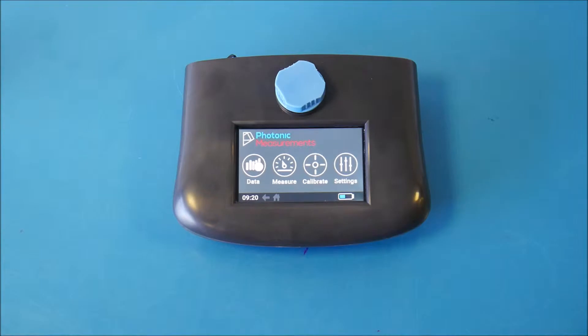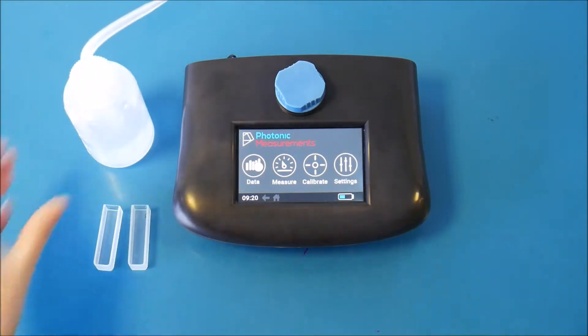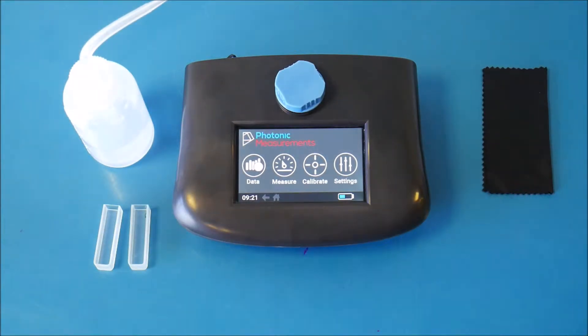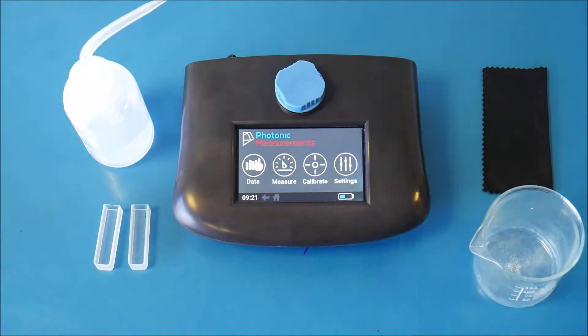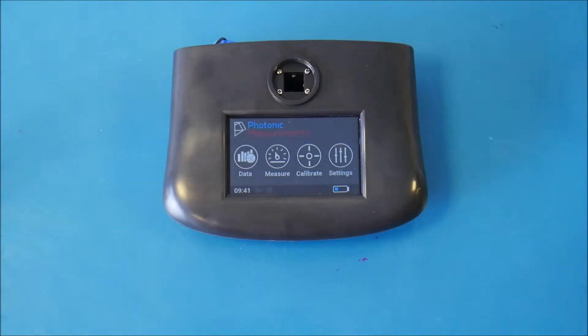To get started with the GO you will need two quartz cuvettes, a sample dispenser, a cloth to clean any residue off the cuvettes and an empty container.